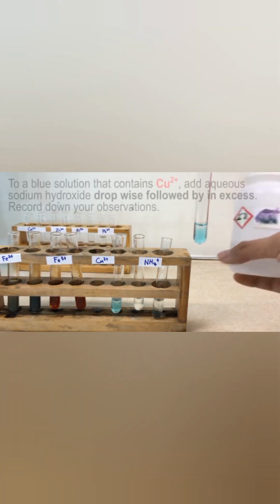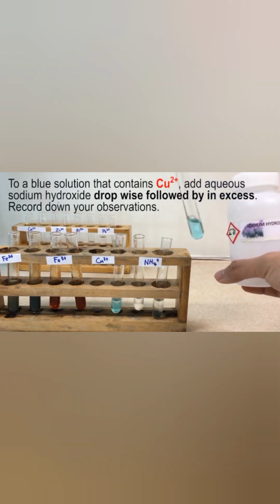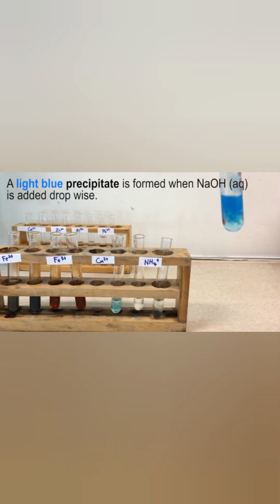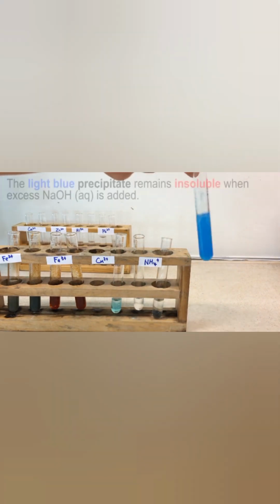Okay, let's go over to copper. To a blue solution that contains copper, add aqueous sodium hydroxide. A light blue precipitate is formed when sodium hydroxide is added in drops.